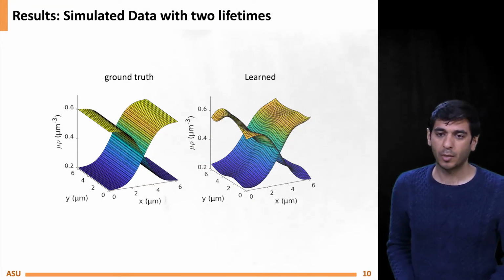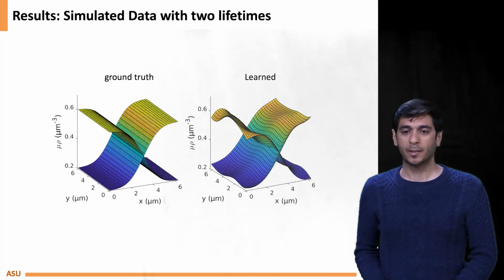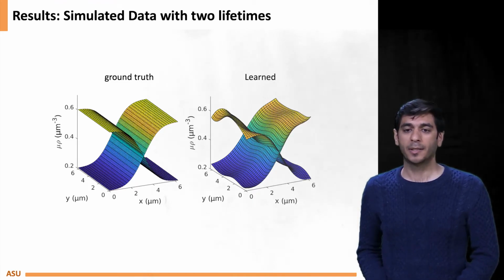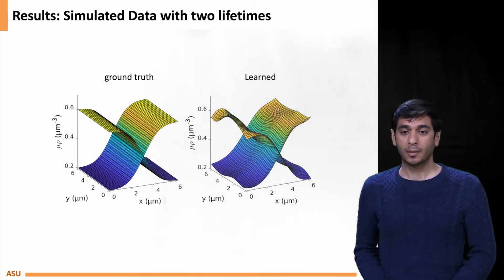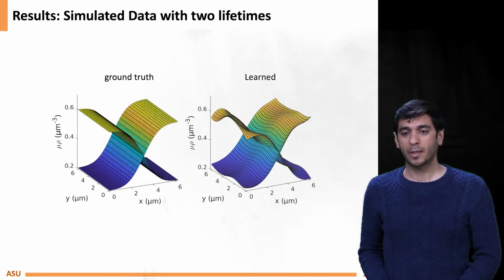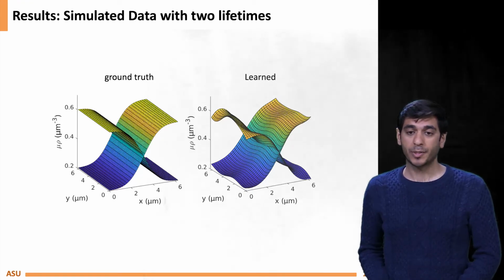We used our proposed framework to analyze simulated and experimental FLIM data. Here on the left, you see simulated ground truth lifetime maps, and on the right, you can see what our algorithm learned, and they match pretty well.